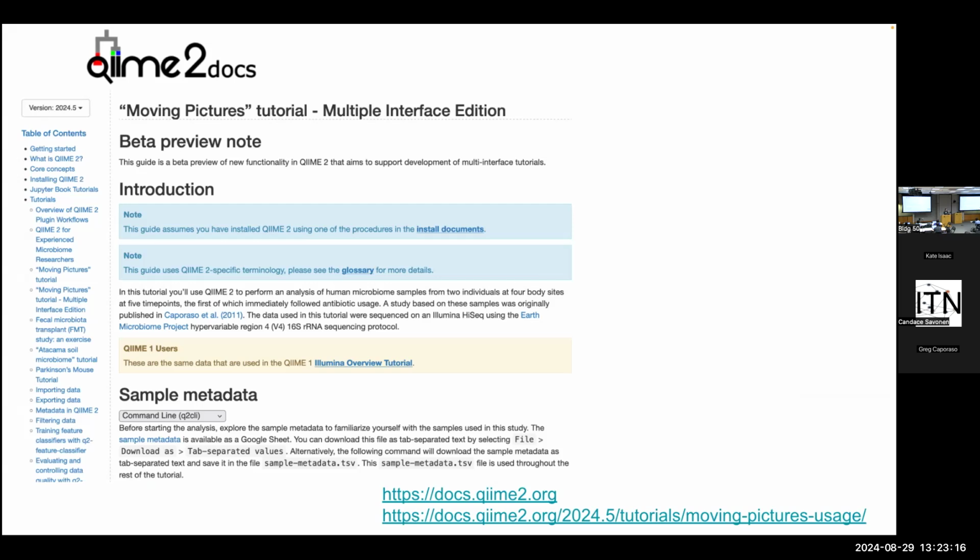And this is going to go from raw sequence data, from raw FASTQ files, all the way through the visualizations and statistics. And so some of them will look familiar. It'll be some of the same visualizations that we generated in here, some different ones. And there's also some taxonomy plotting, which we didn't really get to in here, but that's all covered in this. You can run that through Galaxy. You can run that through the command line using the Docker container that we have here. That would be a really quick way to get started with it for you. Or you can run it through a Python API if you're interested in that.